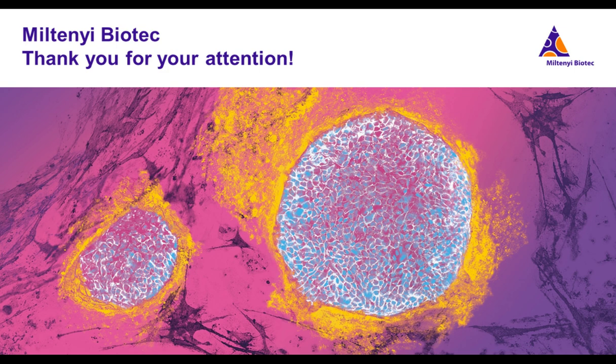As I already said, if you want to analyze soluble factors, you have to use a cross-linking fixation method. But it is also dependent on the antibodies and the specificities you need and the availability of antibodies. If I have all the antibodies available which I need for a certain fixation method, but not for the others, then you would go with the fixation method where you have the antibodies, if you can still visualize what you need to know.